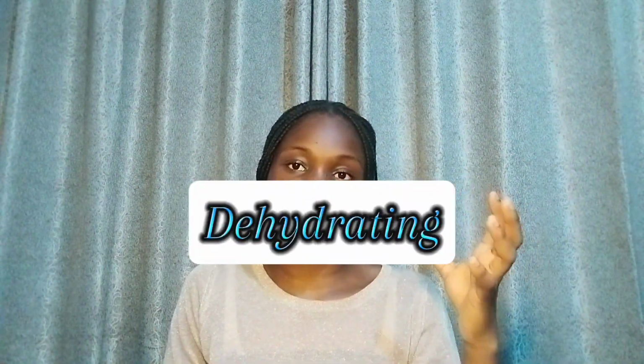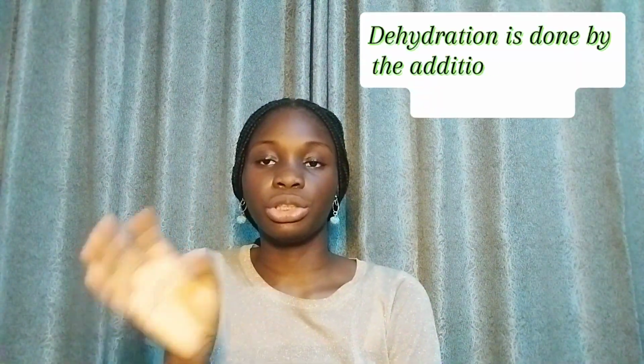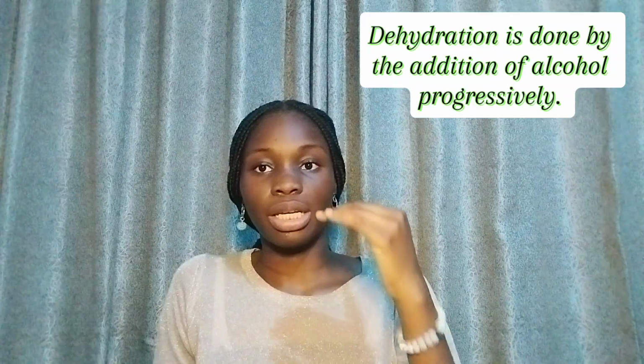The second step is dehydrating. Dehydrating just simply means what it is, removal of water. When you go for a run and you're like, oh, I'm dehydrated. It's very easy to remember because the way you remove water is the same way water leaves the body for people that drink a lot of alcohol. So to dehydrate a tissue, you use alcohol. So you incorporate alcohol into the tissue progressively.